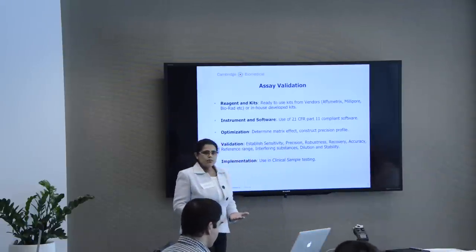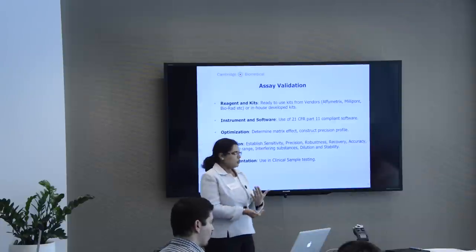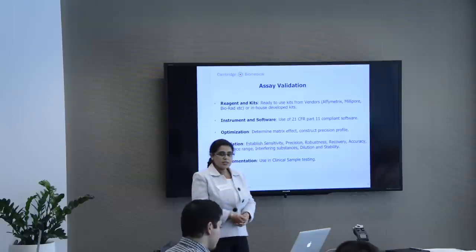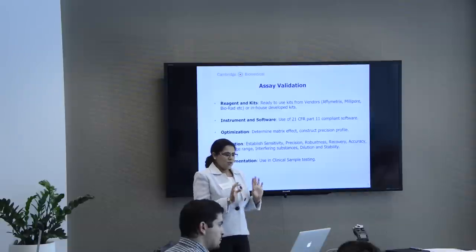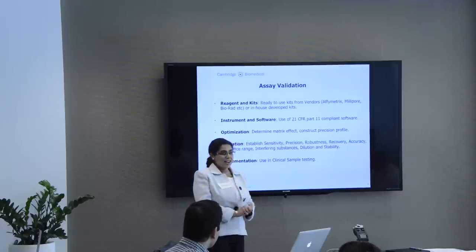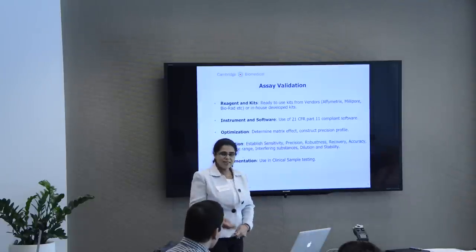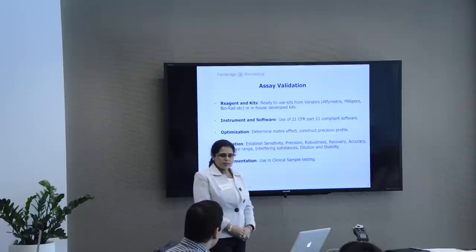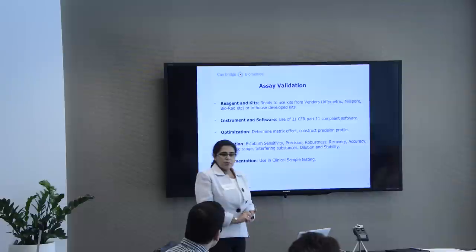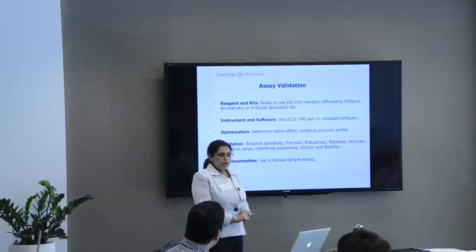So what are the components that you need for any assay validation? You need reagents and kits. You can use ready-to-use kits provided by vendors, or I'm sure Jim Lederer would vouch for the in-house kits, saying no, use the in-house kits. And actually, we have done that. He's a great collaborator. Then the instrument and the software. The instrument has to be validated. The software has to go through 21 CFR Part 11 compliance. If you don't have validated software and a validated instrument, you're not doing validation.